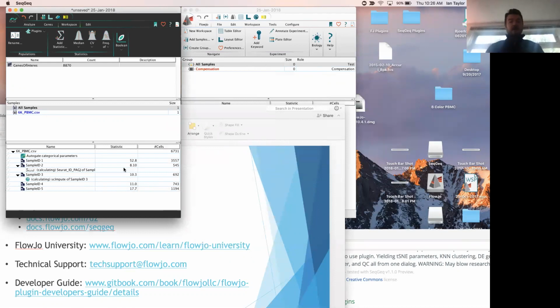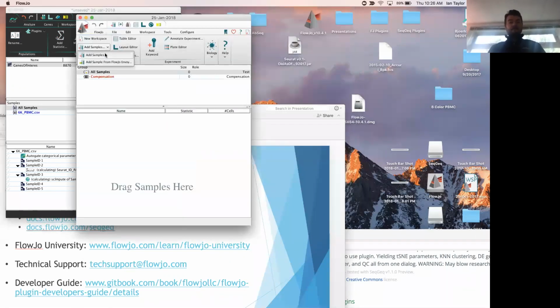While that's happening, they're actually being done on different threads. So running single cell impute is not actually slowing down my Seurat calculations. There's an argument to be made that I could run single cell impute before doing Seurat, just so that I'm dealing with an expression matrix in which dropout events have been corrected for. But meanwhile, I might just move over to FlowJo and show you some of the plugins that are available here.